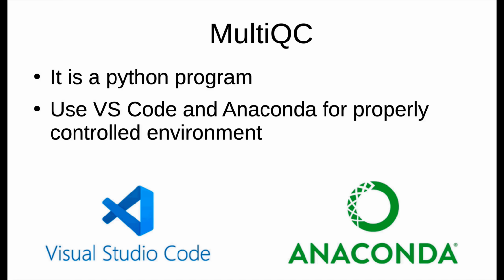The best way out of my practice is that you install Anaconda, which is a slightly different version of Python in terms of its location on your computer, and it comes with plenty of the most frequently used packages, so no big sweat of missing something.